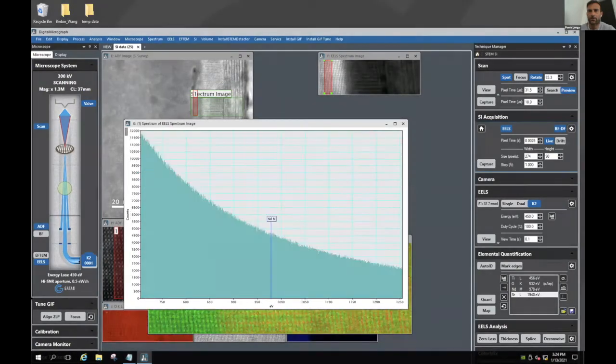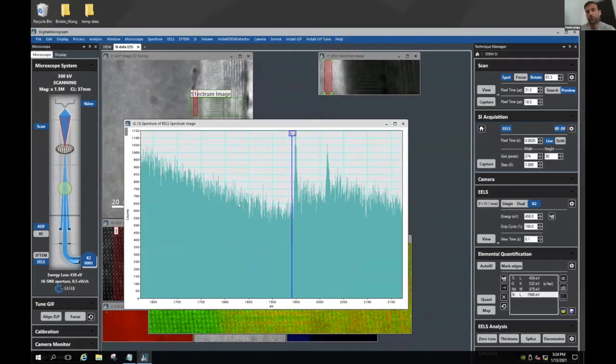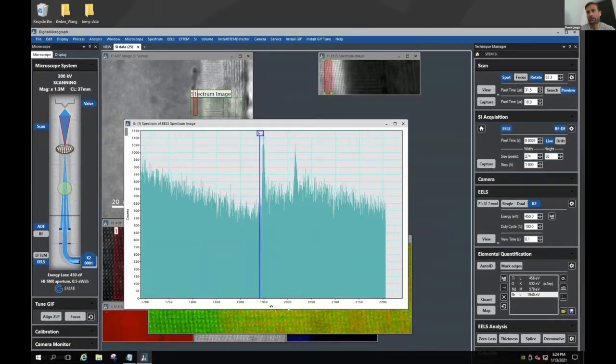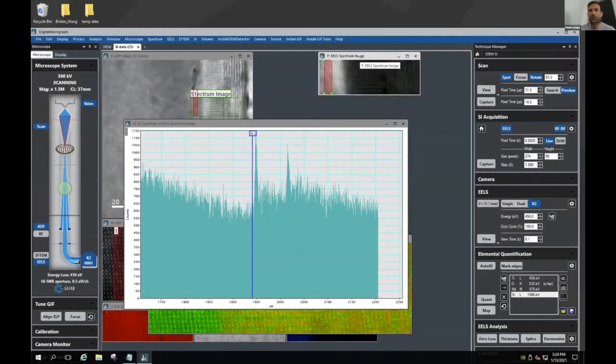so if you look at the strontium here, the strontium looks good, but you see some noise because obviously this is shot noise. How do we make this better? The energy resolution is not an issue here. So there's one trick that you could play. You can bin this data.